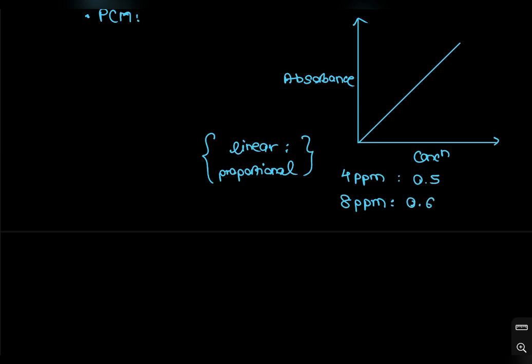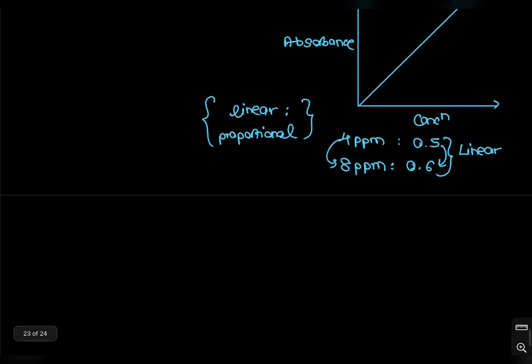So this is linear, because upon increasing the concentration, the absorbance increased. But is this proportional? The answer is no.